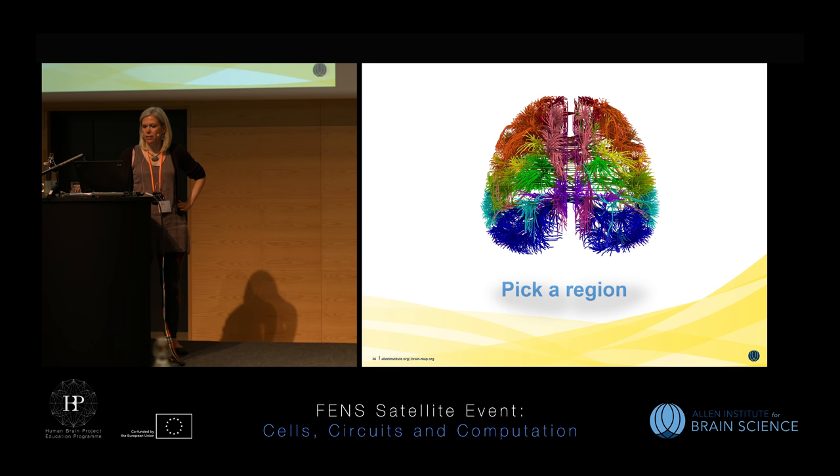So what you're looking at here is all of the experiments that we've conducted. Our first couple phases were all done in the right hemisphere, and we've started to collect data on the left hemisphere, which informatically has raised some issues. So we're working on the interface so that it will work better for you. For example, if you're looking at the reference atlas, you can't actually see the reference atlas on the side that you're interested in. But, like I said, we release the data first, and then typically we figure out the best way to present it to you.